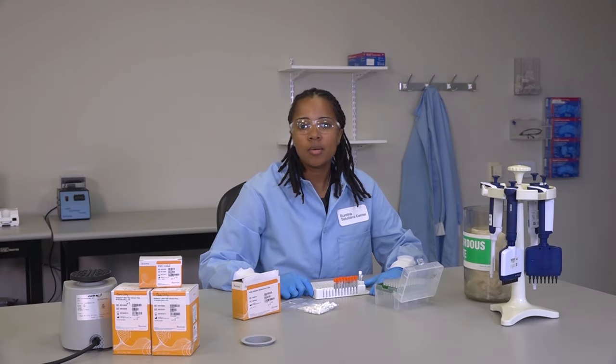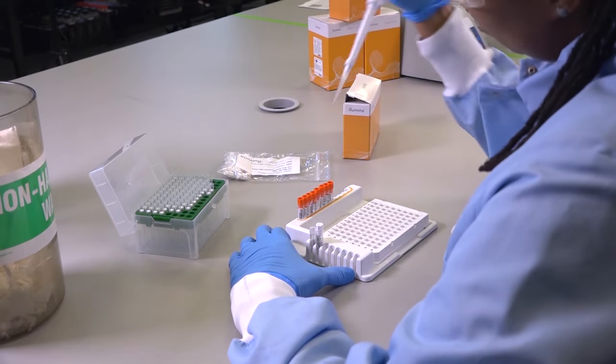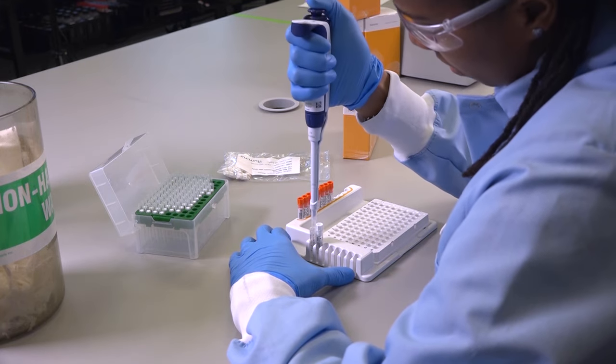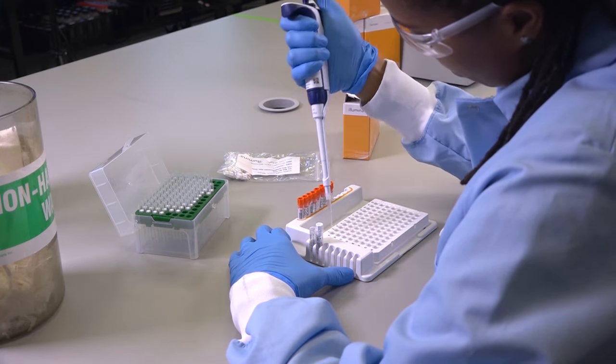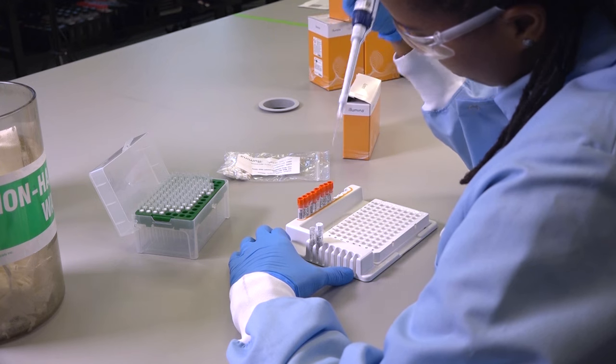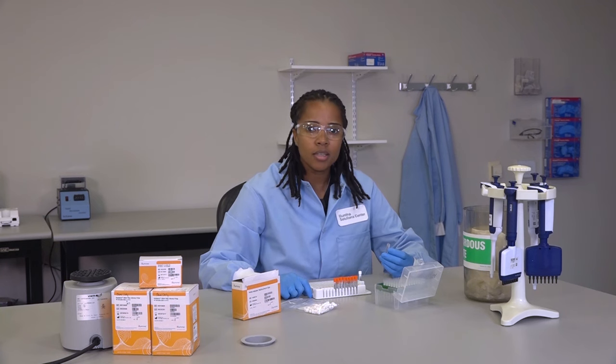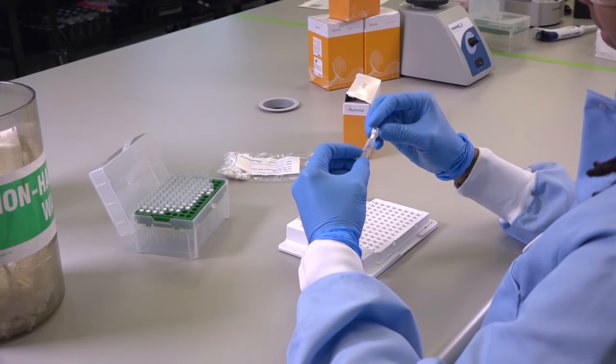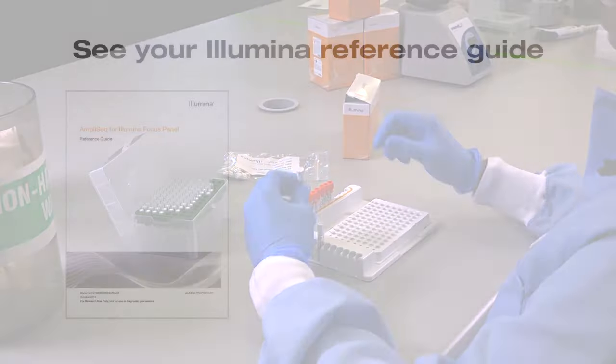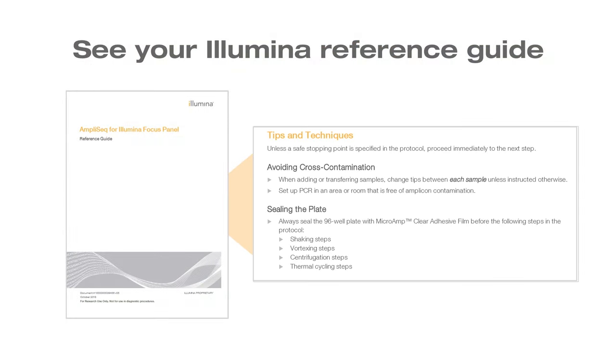When working with Illumina library preparation kits, be sure to change tips between each sample when adding or transferring samples or reagent master mixes. Change tips between each row and column when adding index adapters. Remove unused index adapter tubes from the working area. Open only one index adapter tube at a time to prevent misplacing caps. Use a fresh new cap to reseal the index adapter tubes. Follow best practices listed in the Illumina reference guide for your application.